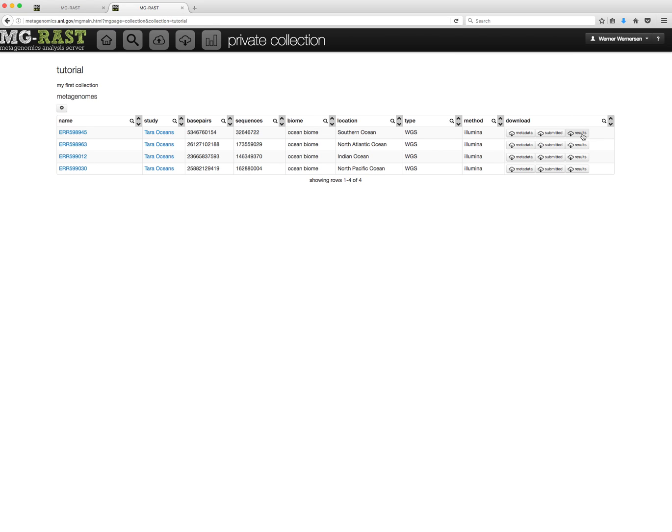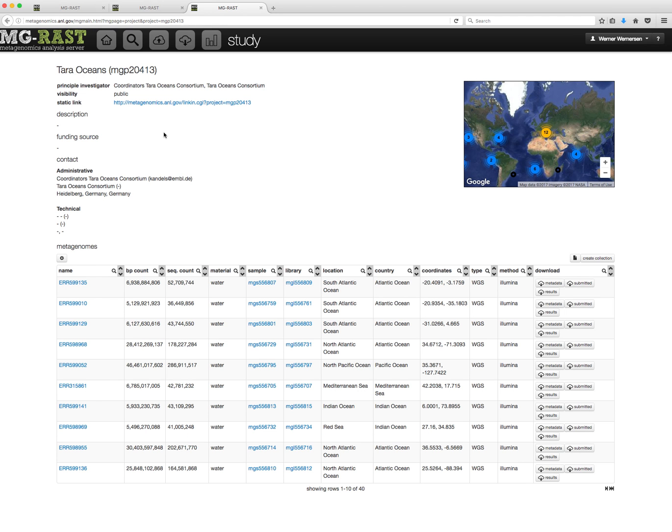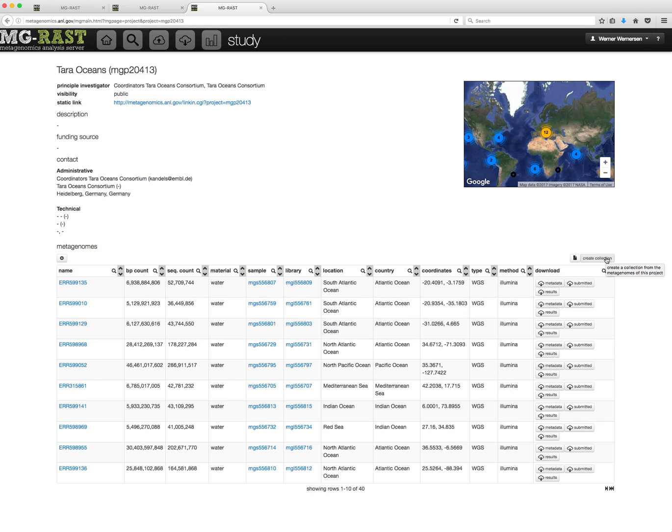As mentioned earlier, you can also create a collection from the study page. Above the metagenomes table, you will find a button Create Collection, which will create a collection of all datasets of this project. If there is no button, you have already previously created this collection.